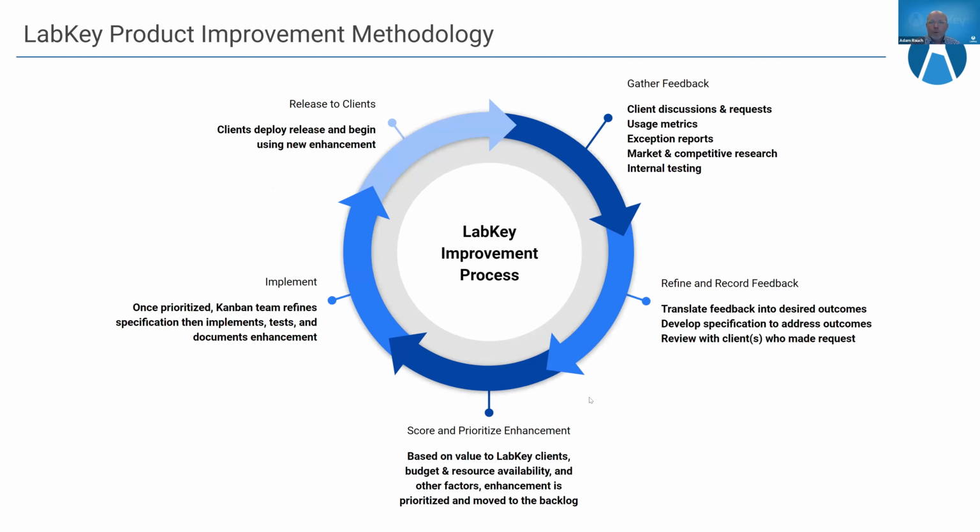So Michael mentioned how we partner with organizations. This slide goes into a little more detail on that, and explains how this process works. In particular, I'm going to be talking about some improvements and enhancements that we've made to LabKey over the last year. This is how that works. So I'll start here in the upper right.